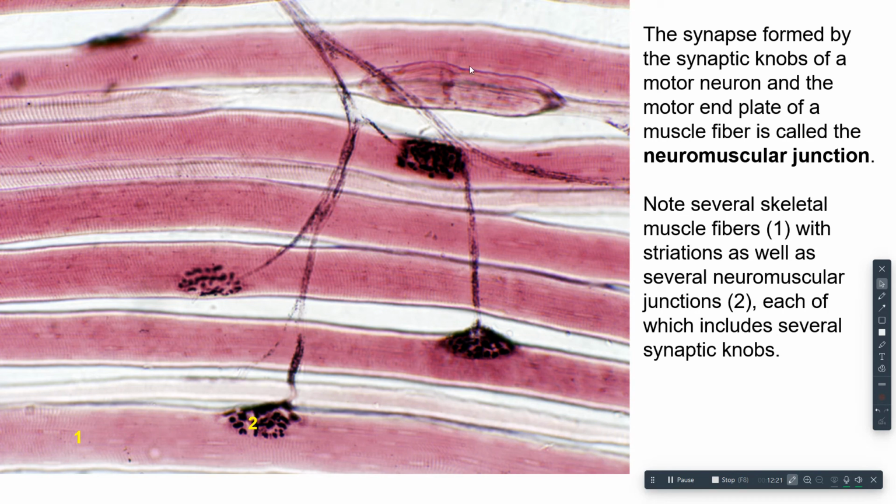So this is skeletal muscle. Again, look, I got 1, 2, 3, 4, 5, 6 skeletal muscle fibers running horizontally. Note their striations. I actually don't see their nuclei very well here, but I know they're going to have multiple nuclei. But what I do see here are synaptic knobs, axon terminals, right? I see axon terminals here. So I got telodendria. The black lines here are telodendria.